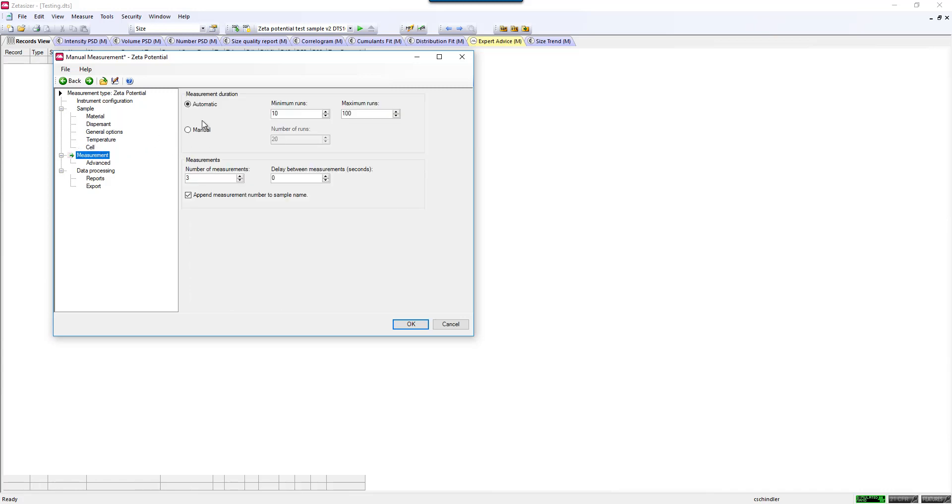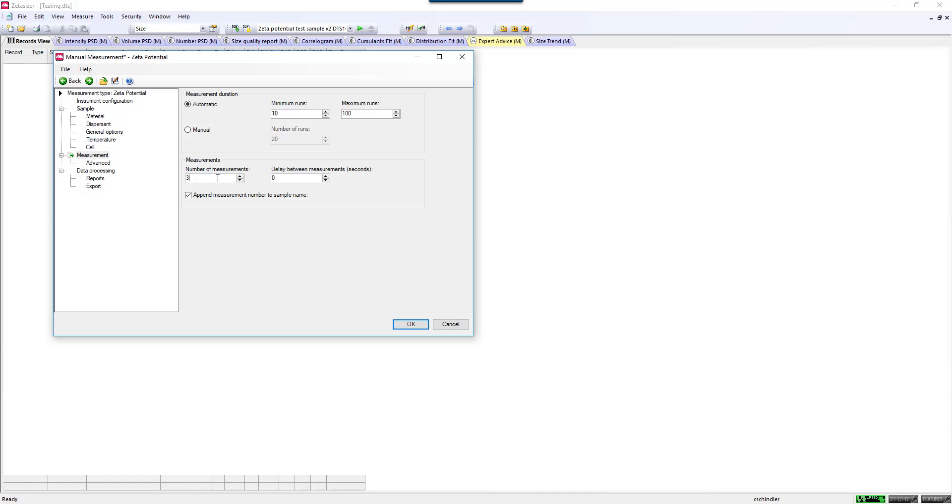For the measurement settings, typically you use automatic settings to run the sample, where the instrument adjusts to how much voltage, how many runs to get good statistics of your sample. But if you're a more advanced user and would like to use manual settings, you can use those as well. The measurements are pretty quick, maybe 30 seconds each, so triplicate measurements are pretty common.